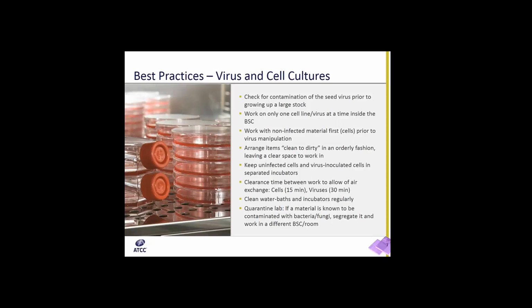When you're working inside the biosafety cabinet, work with non-infected material first, for example the cells, prior to any virus manipulation. And inside the biosafety cabinet, arrange items from clean to dirty in an orderly fashion, leaving a clear space to work in the middle. Keep uninfected cells and virus-inoculated cells in separate incubators, unless of course they belong to the same experiment. Always allow for clearance time between work to allow for air exchange.